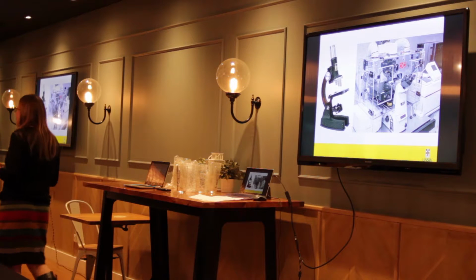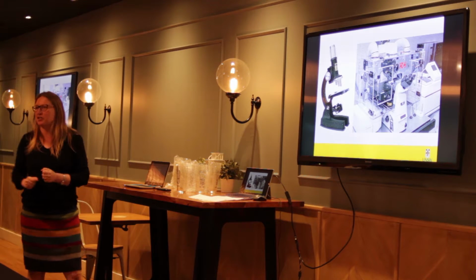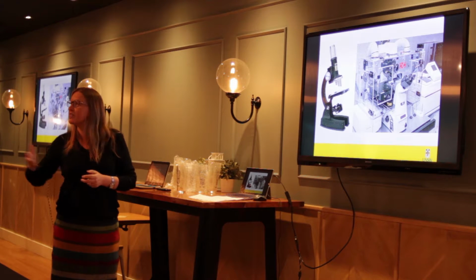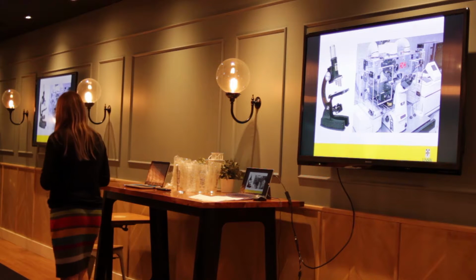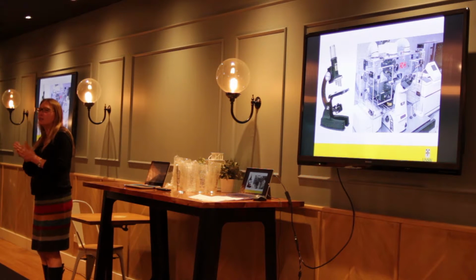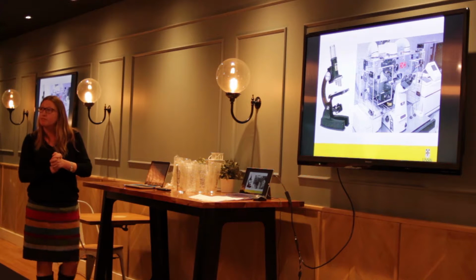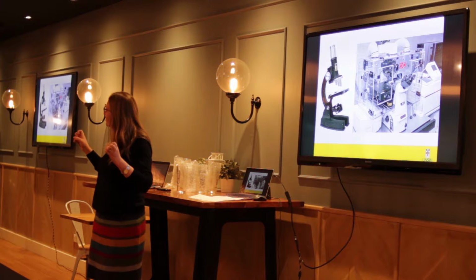However, the microscopes that we use are not microscopes like this. Okay, and there are some other microscopists in the audience, and so they know well and truly. Microscopes that you see, for example, on the right-hand side are confocal microscopes. They have different sorts of detectors. We use lasers.